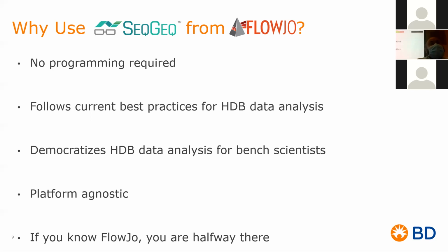Now, you're able to get the data and start analyzing it yourself immediately and do the basic and intermediate steps of analysis, freeing up your bioinformaticians to perform the most advanced analyses only. That way, everybody wins. You get your first analysis done, and you free up your bioinformaticians' time to do the more advanced features.